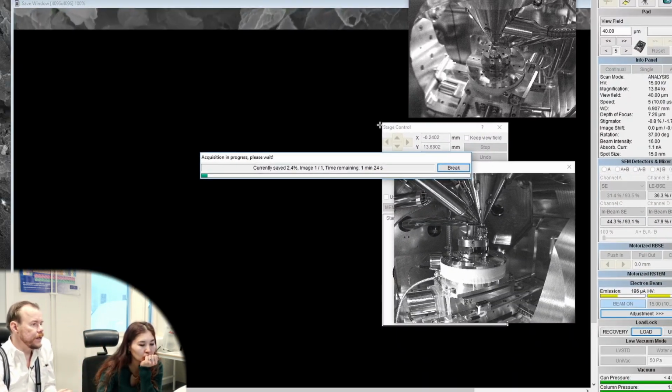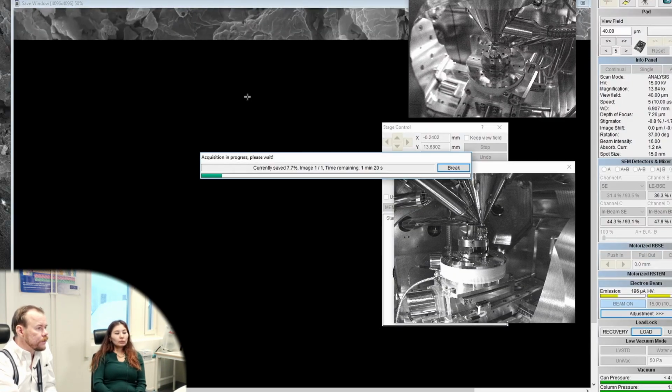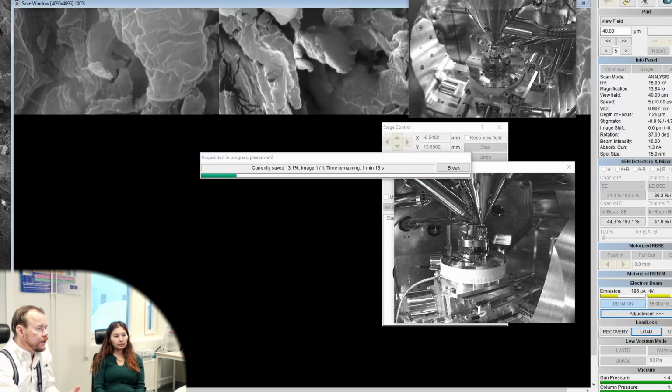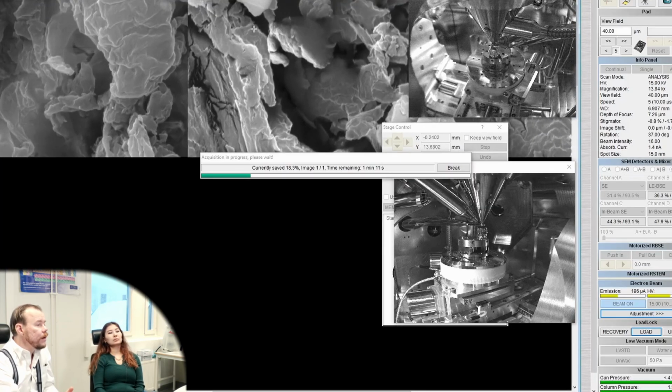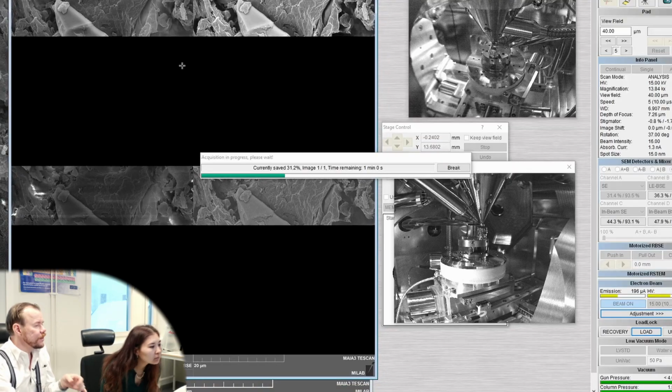And then it starts to acquire the image. And one can use the scroll wheel here also to zoom out. I mean, it starts in original. You see, this image doesn't fit on the screen really. It's 2,000 pixels by 2,000 pixels per channel, right? So since we are using 4 channels, it will be twice the size. It will be 4,000 by 4,000 pixels in size.